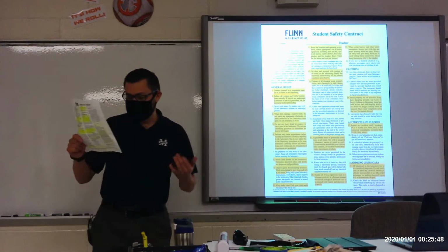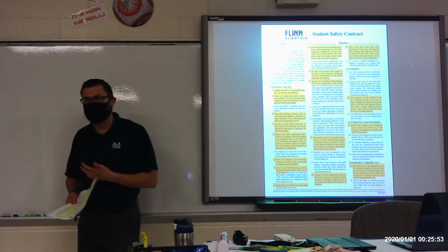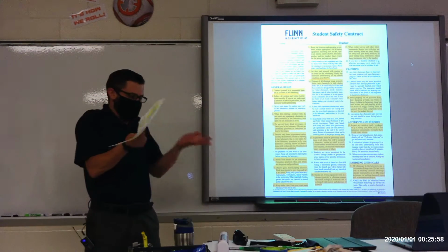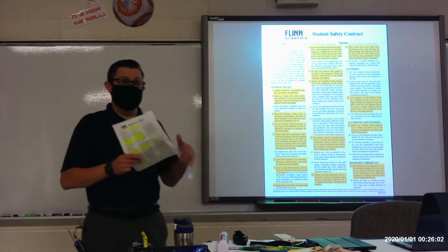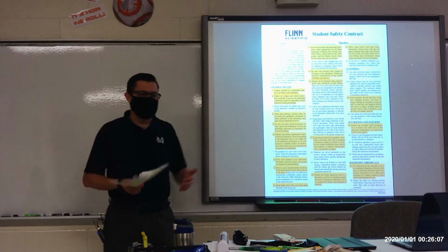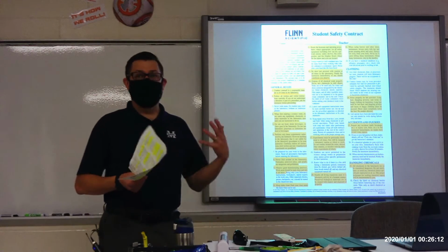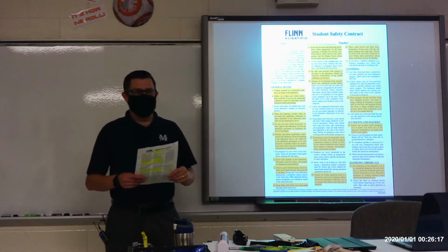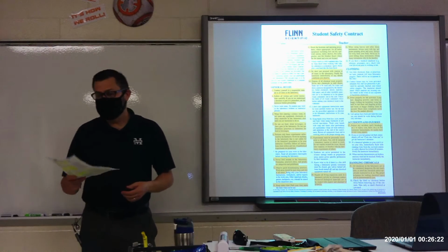Now, when it comes to preserved biological materials, you're supposed to treat them with respect and, of course, dispose of them properly. Okay, just because it's a dead frog doesn't mean that all of a sudden we can be disrespectful to that dead frog. I mean, we're using it for a purpose. We're trying to learn something from doing a dissection, not just happily cutting up something dead. And that, of course, gets into the kind of horseplay and just using that dead specimen for some jokes and some pranks rather than actually learning something from it.